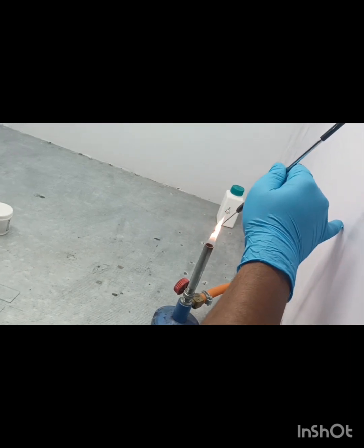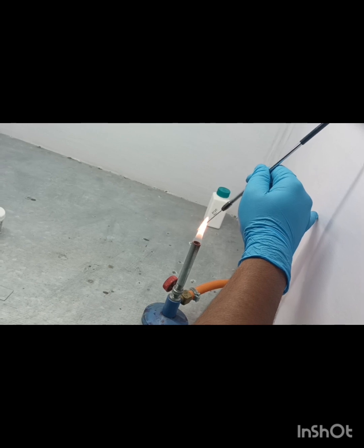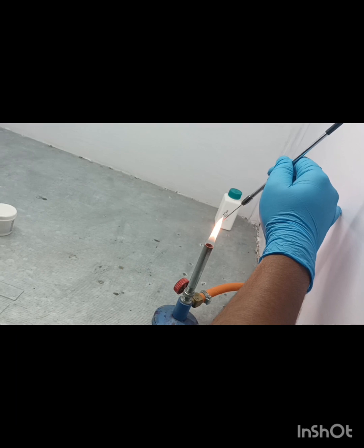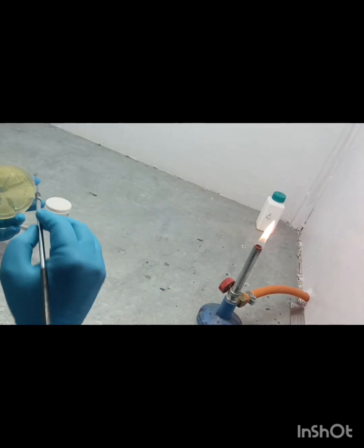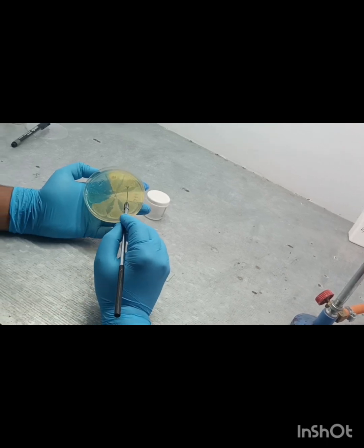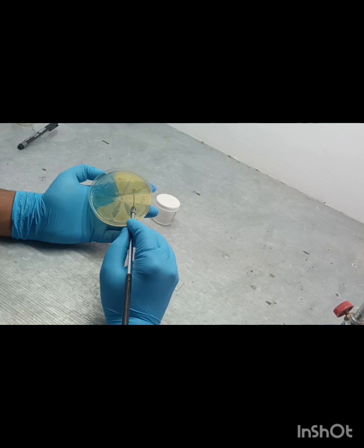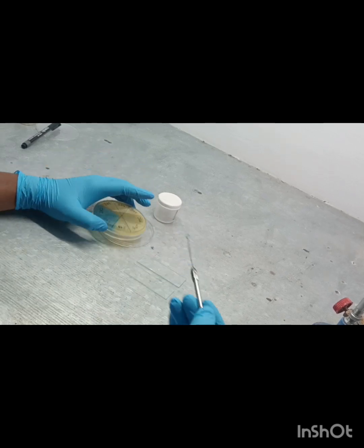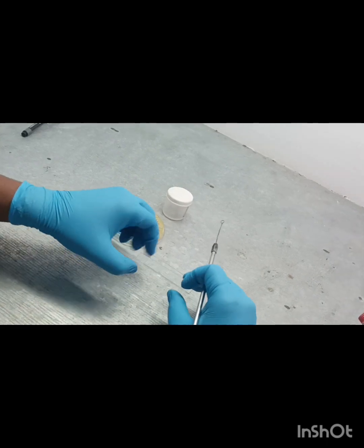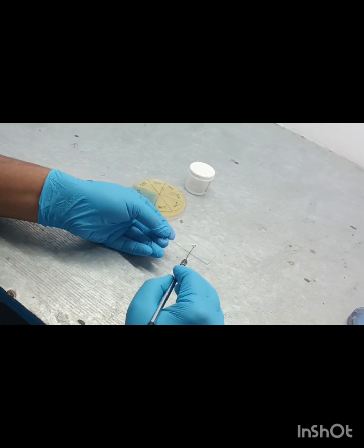Again, we have to sterilize, red heat sterilization process. After sterilization, we have to take a little bit of the colony and mix with the distilled water present on the slide like this.